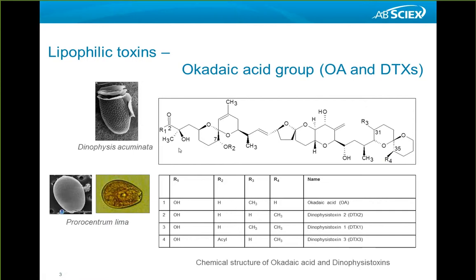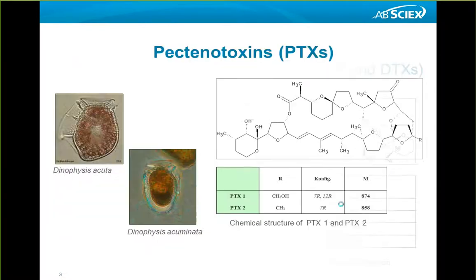That's also where the name comes from. However, nowadays we're also shifting the vocabulary a little bit and calling this group of toxins lipophilic toxins. And as you can see here, we have DTX 1, 2, and 3, we have the okadaic acid itself. So always in this application field, we want to make a kind of multi-method for these substances.